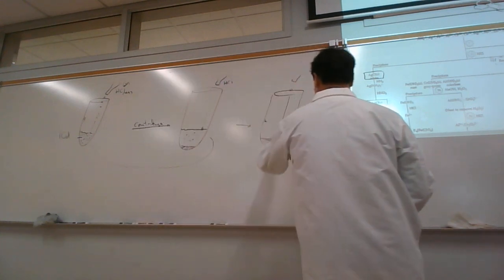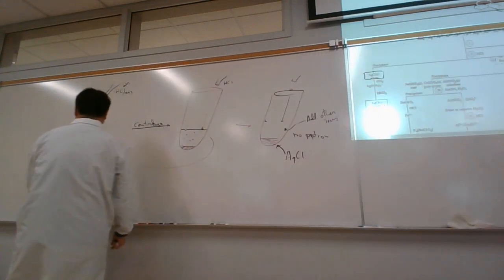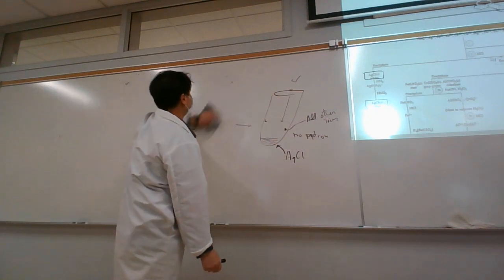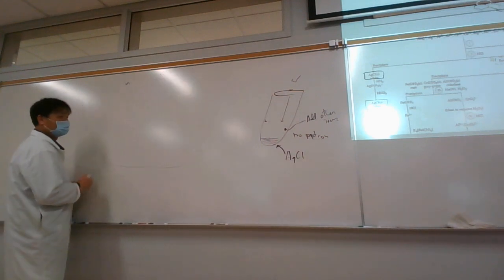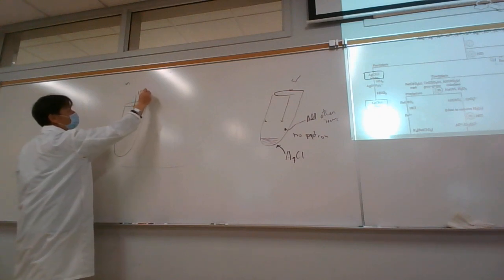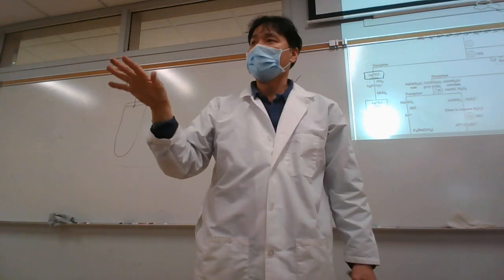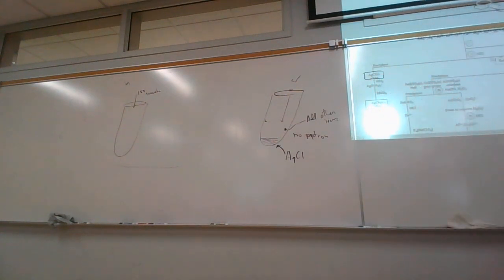What I want to do is I want to make sure I get all the ions over here, and that's going to involve this. So you put in the first wash. Now, how much do you need to wash? Well, you kind of estimate about how much you would need to wash this with. But to give an idea, let's see how much they say to wash with.